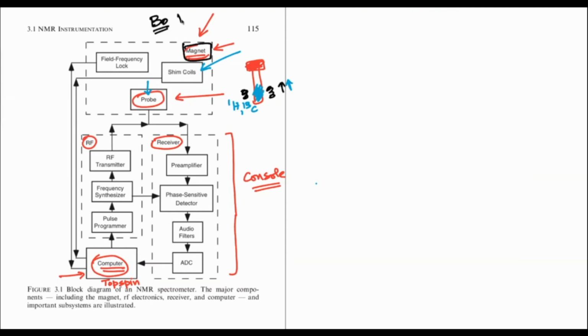B naught helps you achieve a certain magnetic field strength, and this is achieved by the use of superconducting coils. Superconducting coils are ones where, when you reduce the temperature, they have almost zero resistance, so you could obtain the highest of magnetic fields. Nowadays, there is a serious quest to achieve superconductivity at room temperature, and if it does happen, NMR would benefit significantly from it.